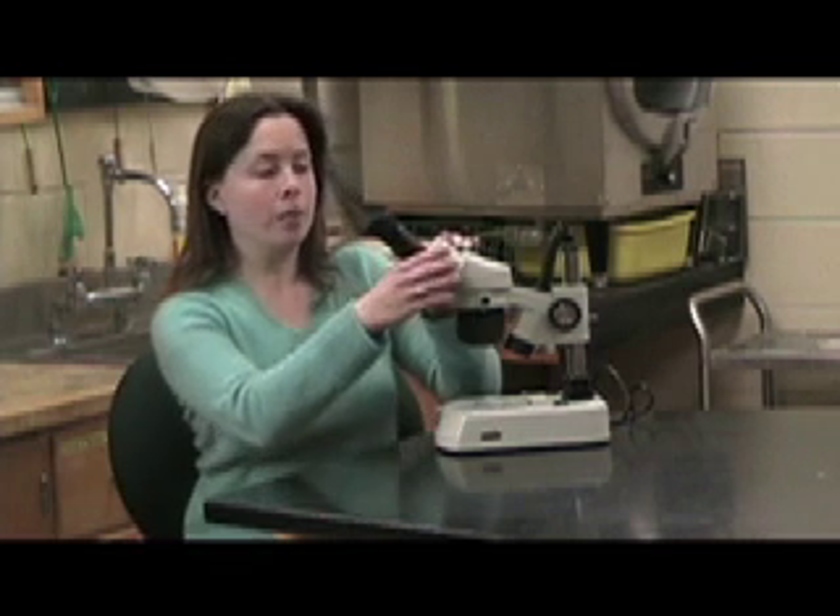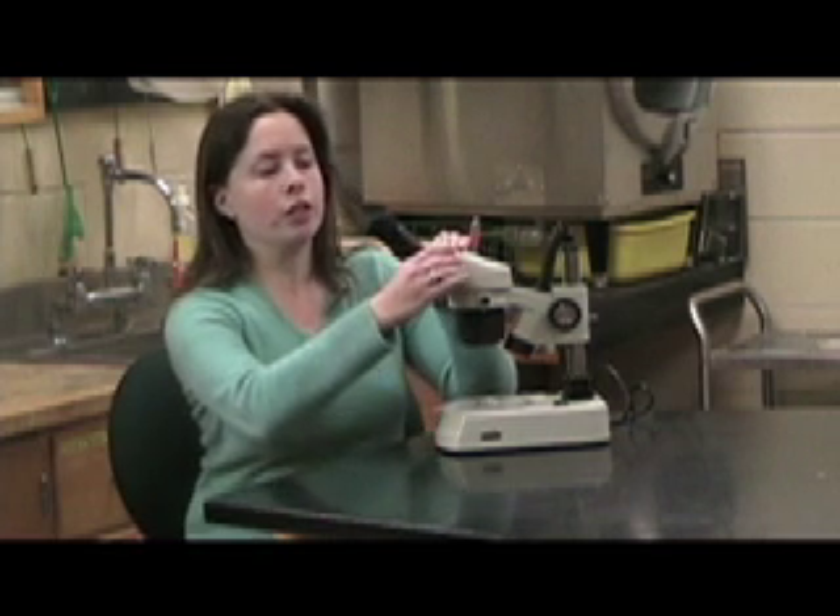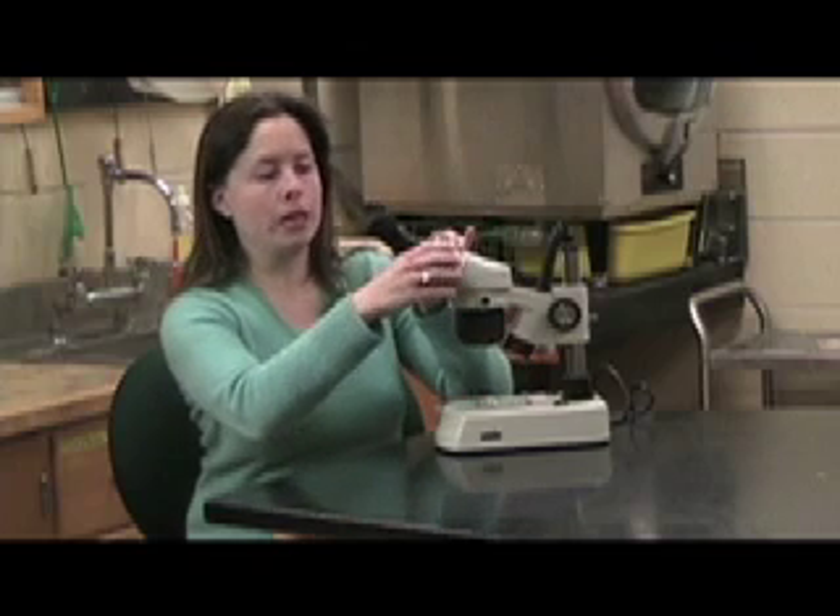Another microscope that you are going to be using is called a dissecting microscope or a stereoscopic microscope. There are some differences between the binocular compound light microscope and this dissecting microscope. It still has two oculars so it is binocular, and you can change the distance between the oculars by rotating them.